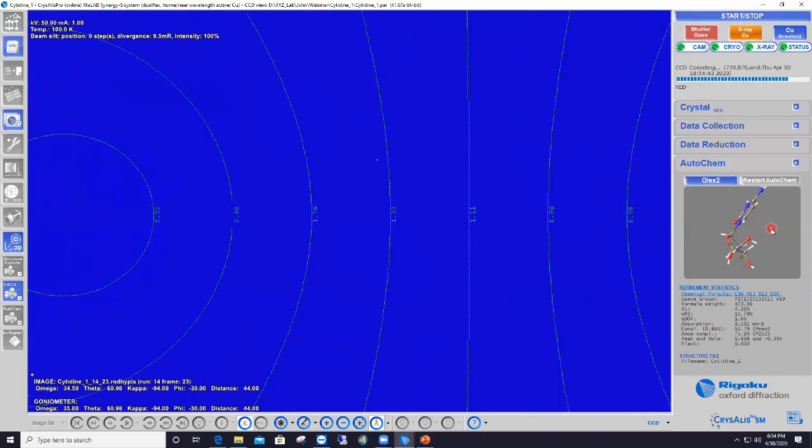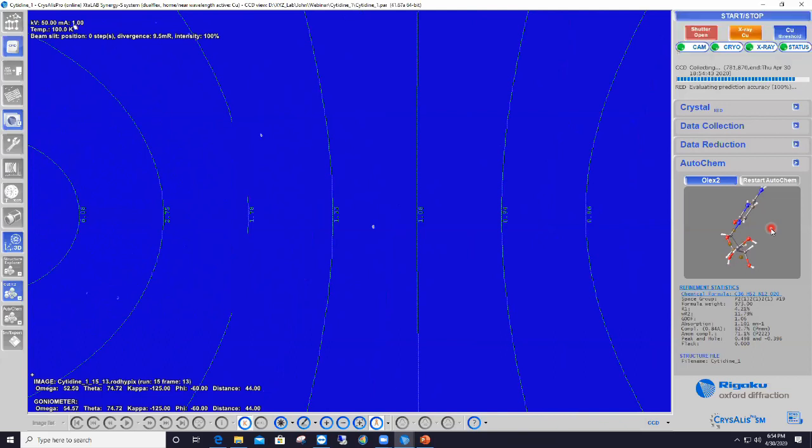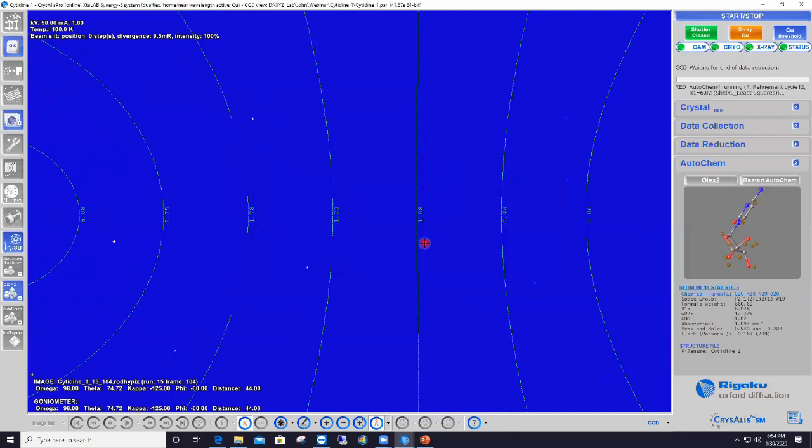So what the blue lights are telling you is the speed at which the data is being collected. And I don't remember what your Hertz rate was, Pierre. But you can see when it's going slowly, it's idle and moving between scans. When it speeds up, it's telling us that it's collecting image data. The faster that goes is the faster the image data is coming off. It will operate up to 70 Hertz. It's made up of 3 sensor modules.